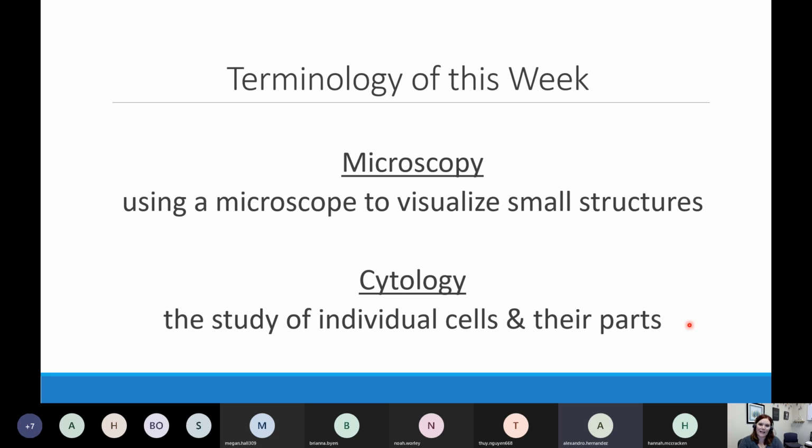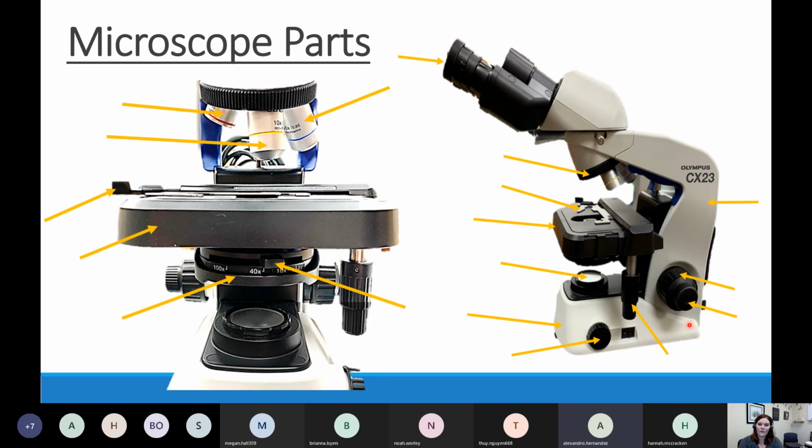So we're going to look at the organelles that are in cells, just like you read about at the beginning of the lesson number 2 packet for lecture. We're going to talk a little bit more about those organelles and identify them on our models in this lab portion here. So when we talk about microscopes, there are many important parts of the microscope that all do different things. I'm going to walk through the microscope with you, help you to label things, and also describe what each of these things is doing to help you later when you're matching up the names of parts with what they do. So let's talk through the way that we would use microscopes in a typical lab class.